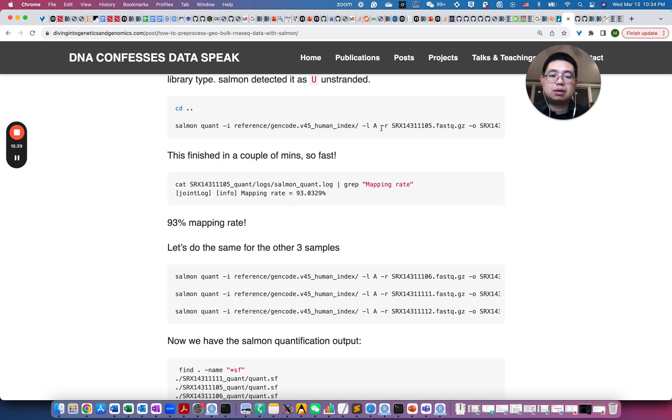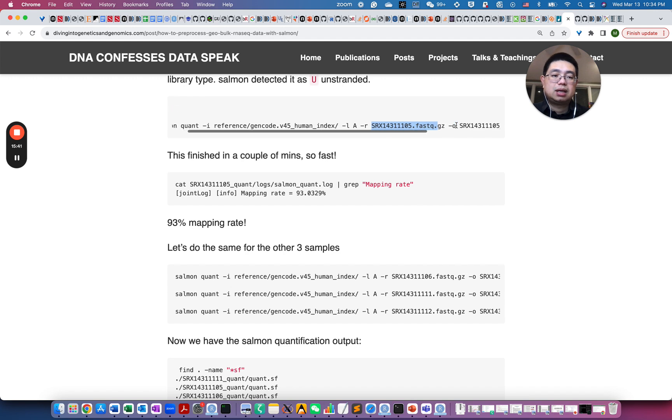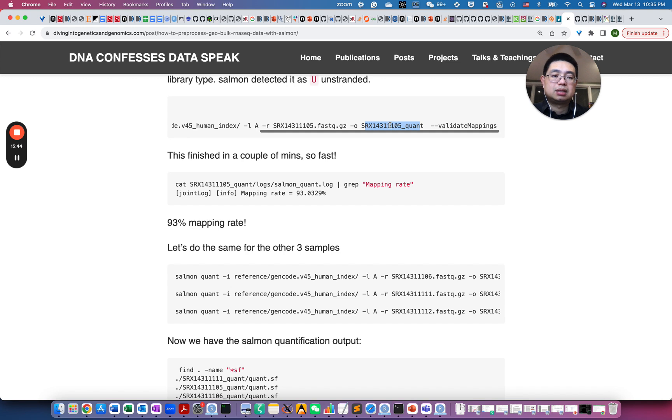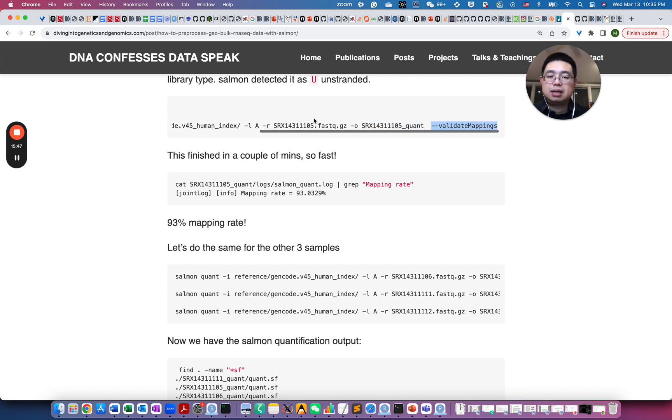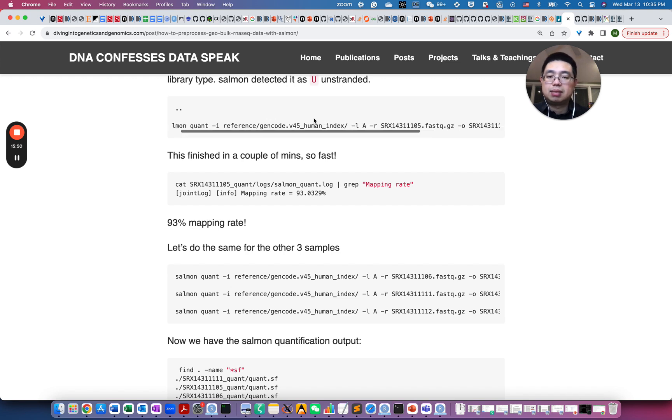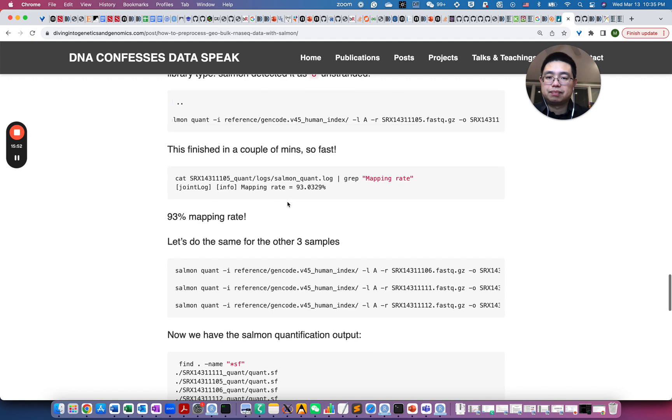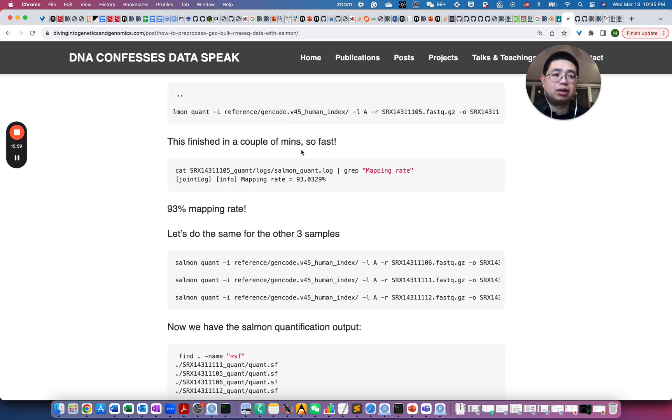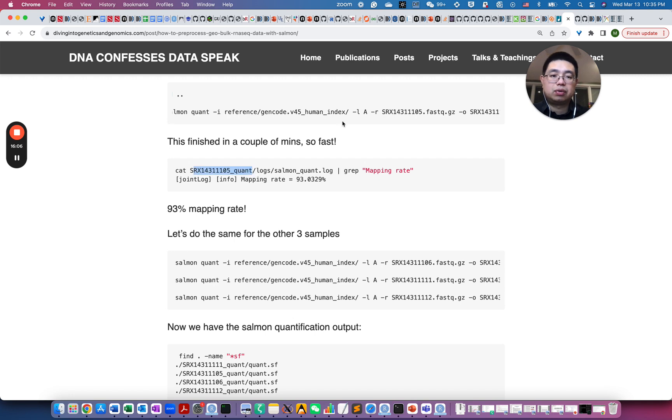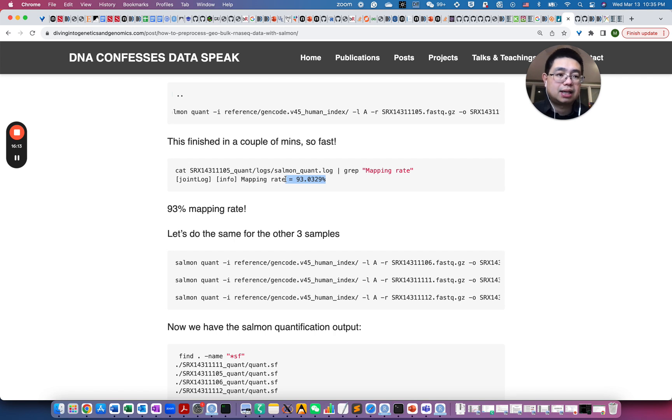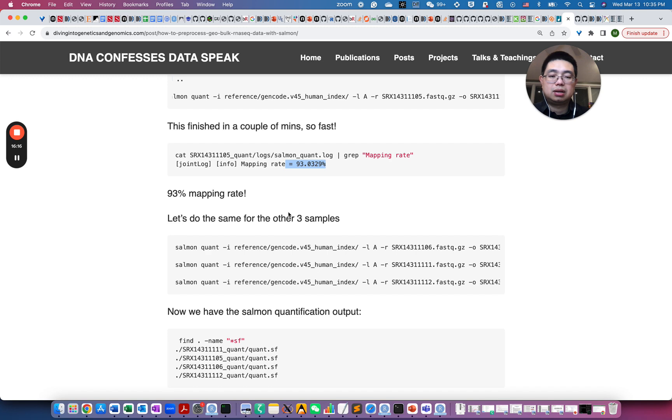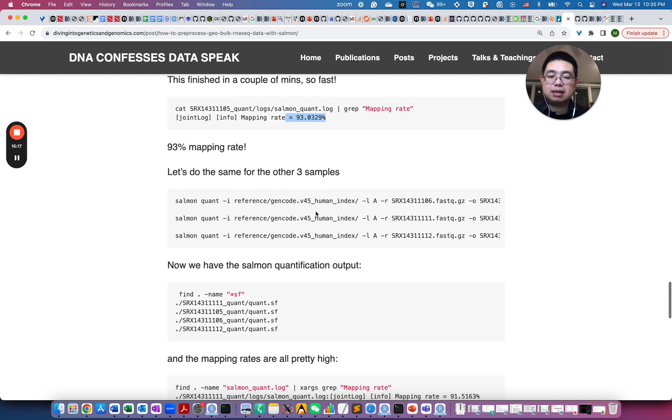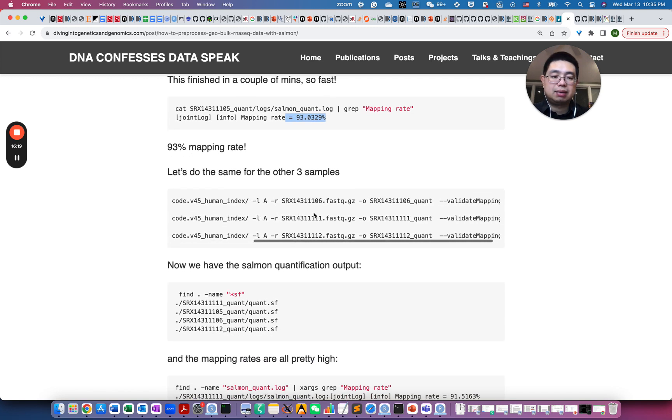So after you specify the reads and output folder and some other arguments, validate mappings, and then Salmon will do the mapping for you and the quantification for you. So it actually only takes like a couple minutes actually to finish for one file, so it's really fast and actually very accurate. So after you finish that, then there will be this quantification folder, and then there's log, and you can actually look at the mapping rate here. It's like 93% of the reads that are mapped to the transcriptome, which is pretty good. So then we just do the same thing for the other three samples.